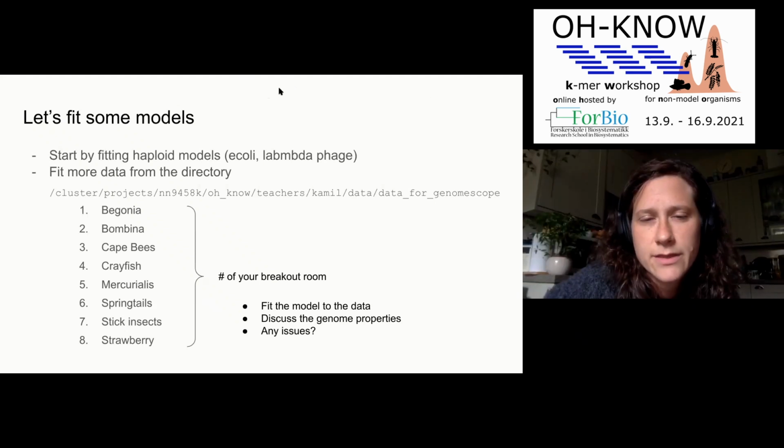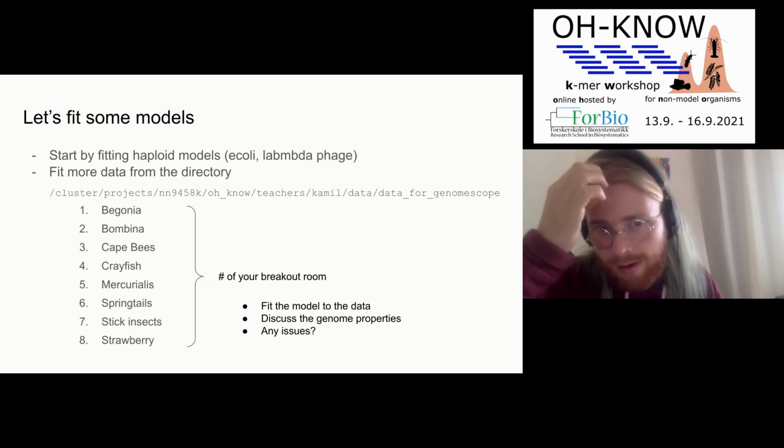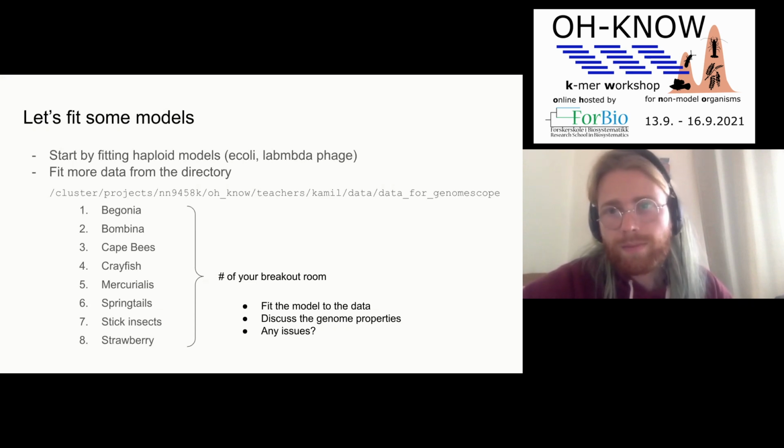We have a raised hand, I think. Can you ask the question then? Yes. So in the web server, now it's clear to me after Lucia's presentation, but in the web server, you have a field for maximum Kmer coverage. So actually that means, if I'm understanding well, the coverage of your sequencing. So related to what Lucia was saying, be careful about the model and the parameters, right? Am I correct or am I wrong?